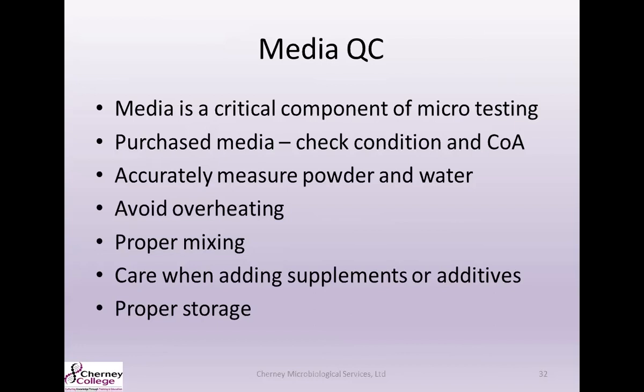So let's talk more about the media QC. Media is a critical part of processing samples. Obviously, you can't have accurate recovery and accurate results without it. So you need to make sure that it's prepared correctly when doing so in-house. Make sure that all media prepared is stored correctly and that the media QC is tested prior to use on customer samples so you can make sure that the media performs the way it should.